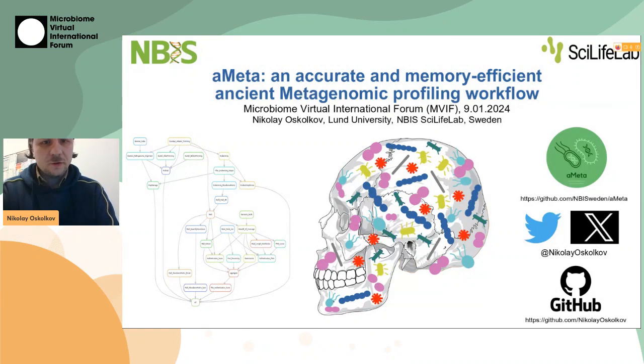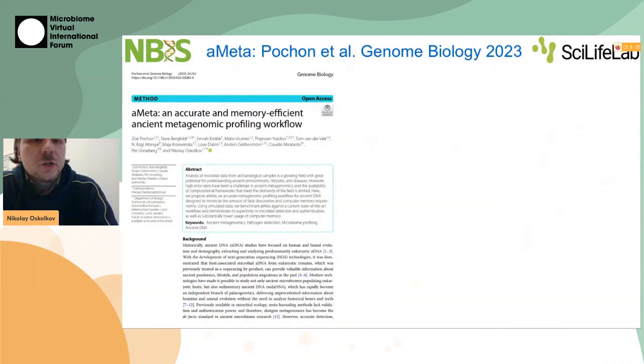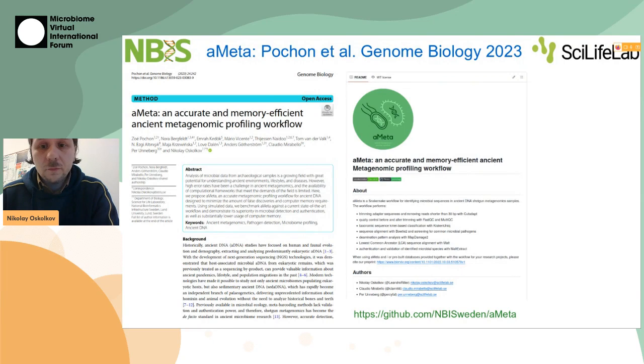I'm Nikolay Oskolkov, a bioinformatician from Lund University in Sweden. And today I'm going to talk about our recently published computational method, which is called aMeta, an ancient metagenomic profiling workflow. And it can be installed from this GitHub page.